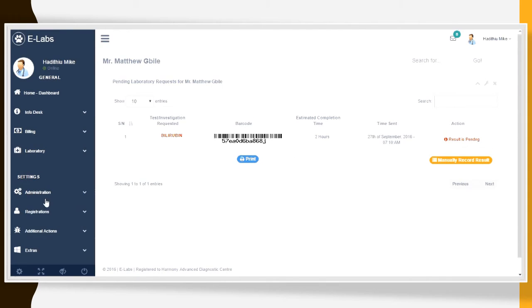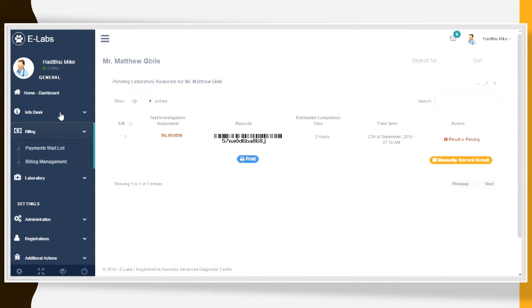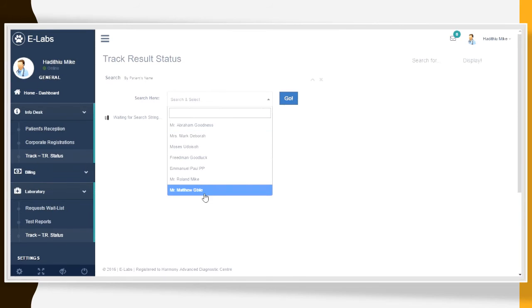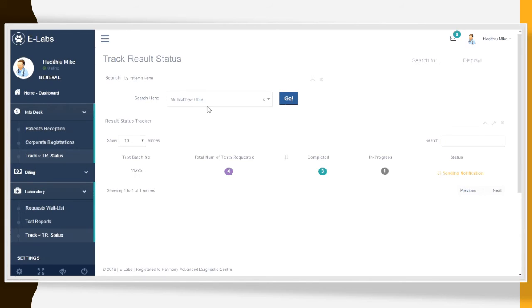they don't report anything to the patient, except this is finished, except the whole test is completed. So we want to check and see what's going on with this test, want to track the status of this test. So if it needs to be tracked from another department outside the laboratory, it can be done. Okay, let's say the receptionist wants to track the patient's test report status.